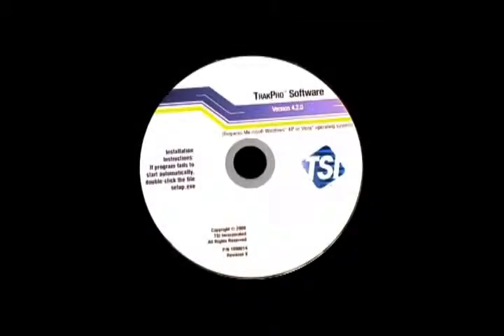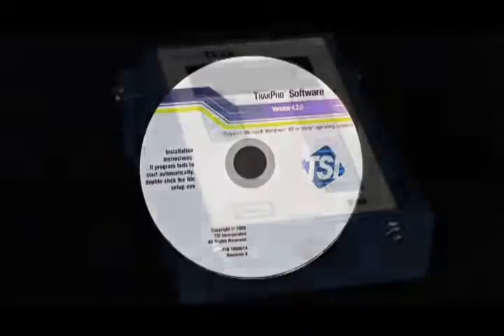You can program the DustTrak with the supplied Track Pro software or manually. We will cover the manual process first.